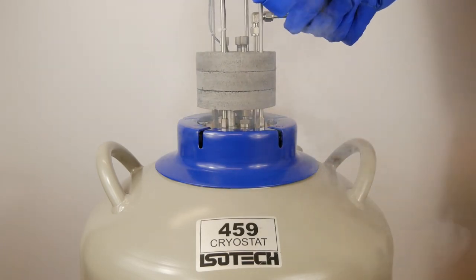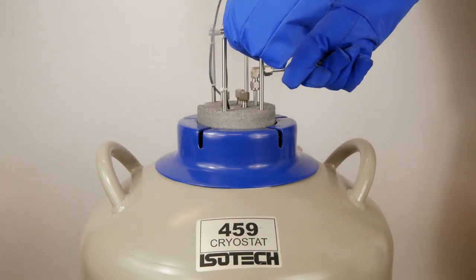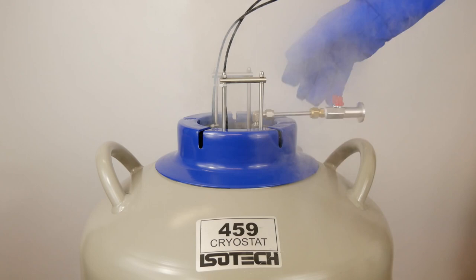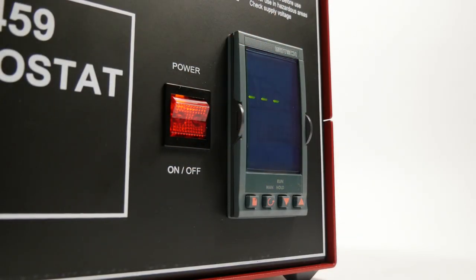The temperature controller pumps in heat to raise the block temperature over the range minus 80 degrees C to minus 180 degrees C. So it's necessary to fill the flask with liquid nitrogen and to top it up during its use.